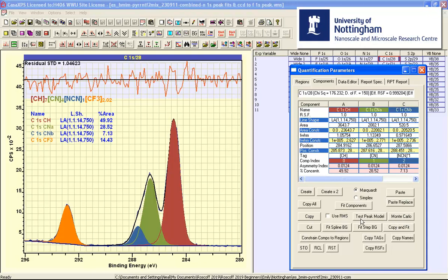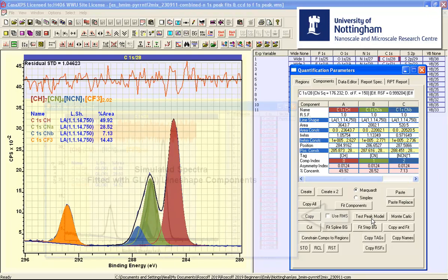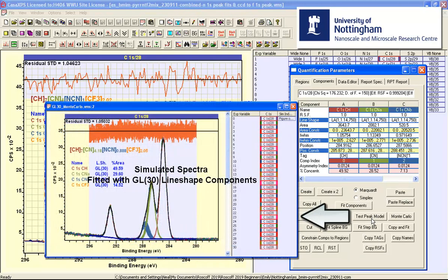There is another button that says test peak model and this is more basic in the sense that it does not calculate any statistics but what it does do is it provides a sequence of spectra which have been simulated and fitted using the peak model.